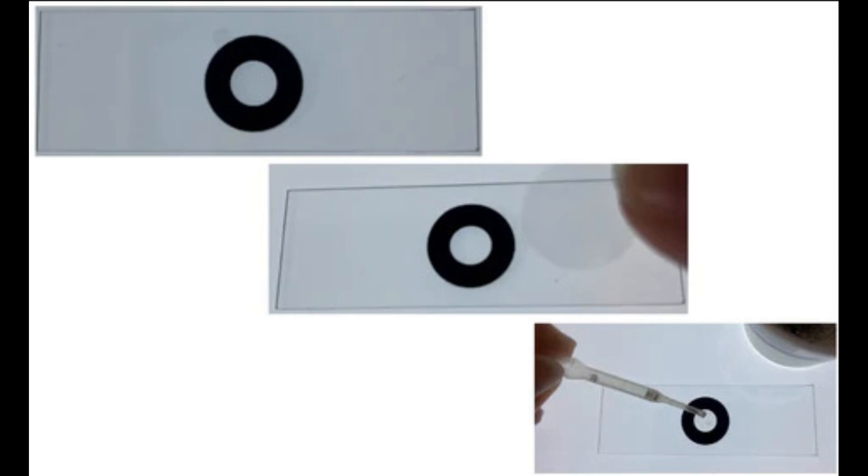To use them, peel the ring off of the sticker sheet, stick it to the center of a slide, peel the clear sticker off the top. Add your drop of water, then put the clear sticker back on to seal in the liquid. Place it in your Foldscope for further study.